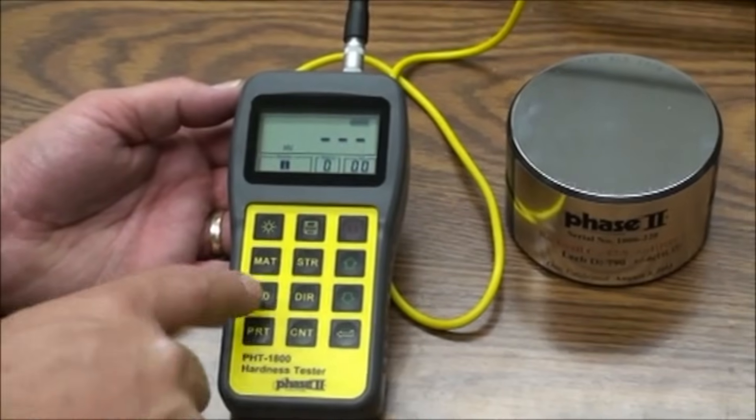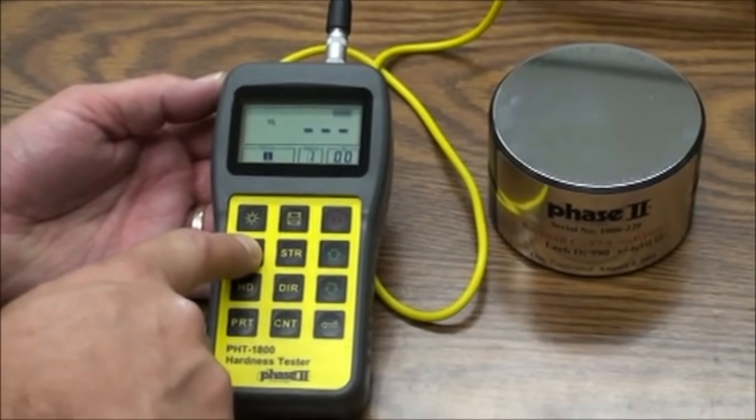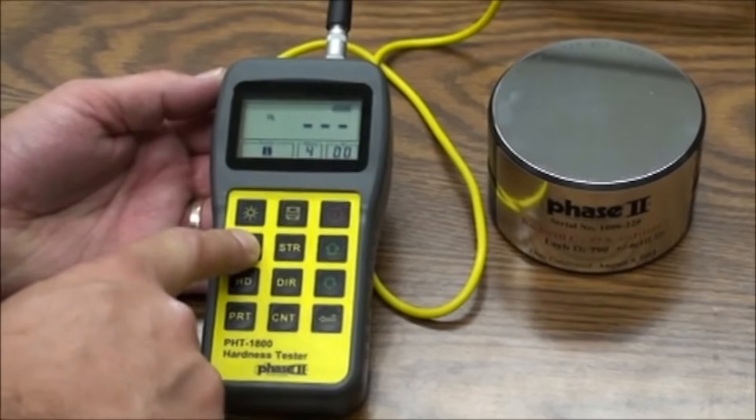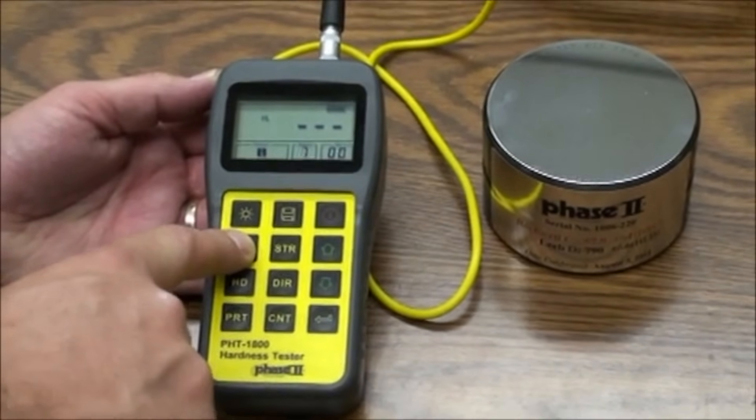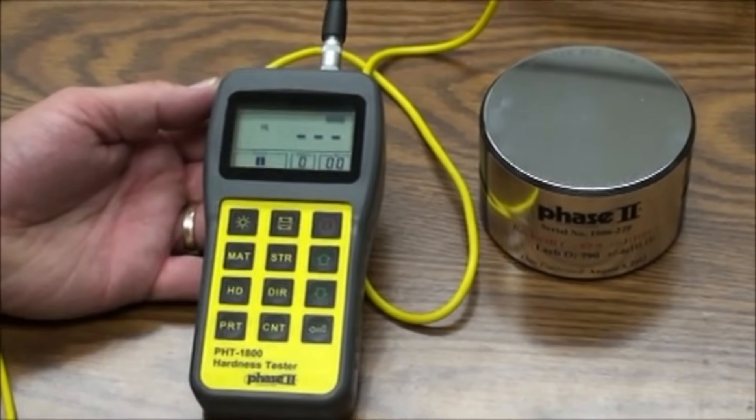Press the MAT button to preset the material you'll be testing. Continue pressing the material button to scroll through the menu. Stop at the correct number for the material of your choice.